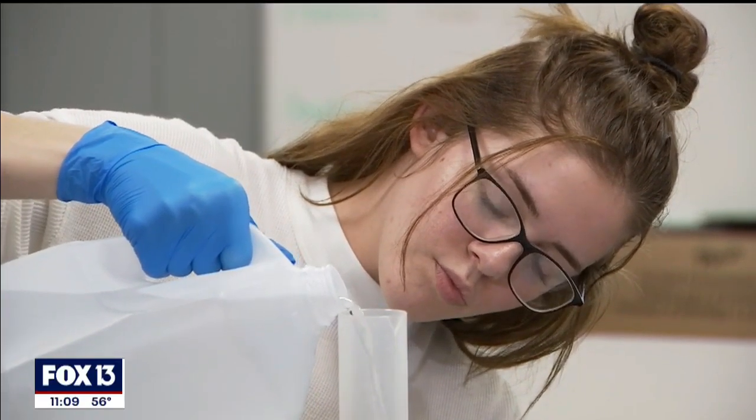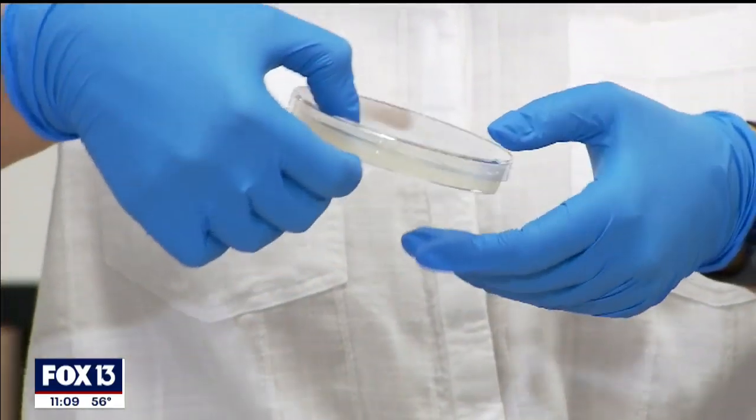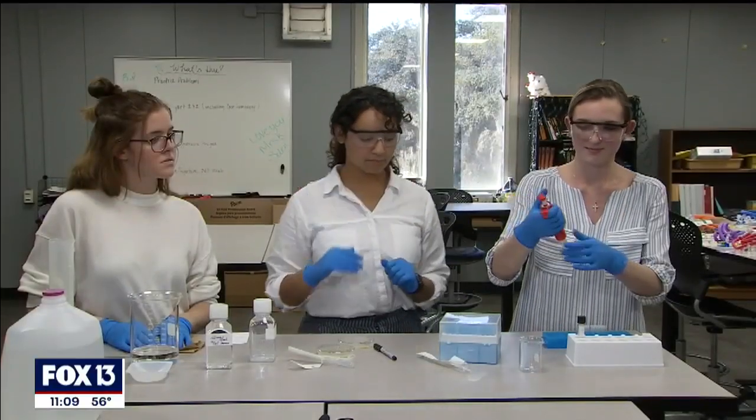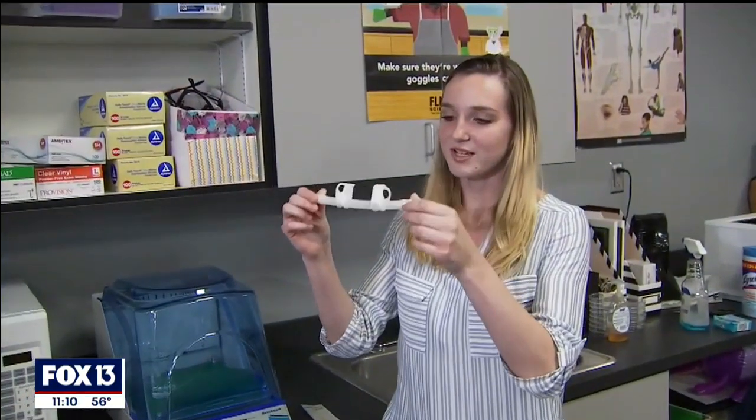With gloves on their hands. We're just going to spread this amoxicillin. And a burning question on their minds. You expel the tip. These students are looking up, way up, for answers. This is what we send up to space.